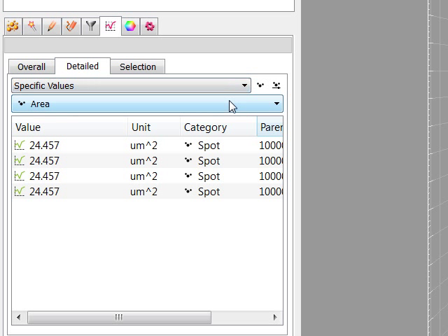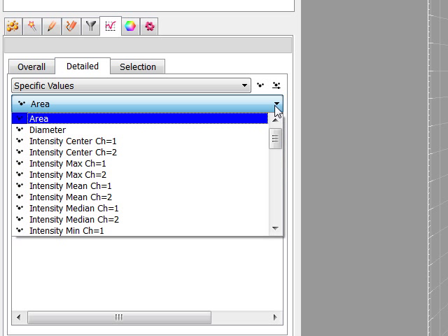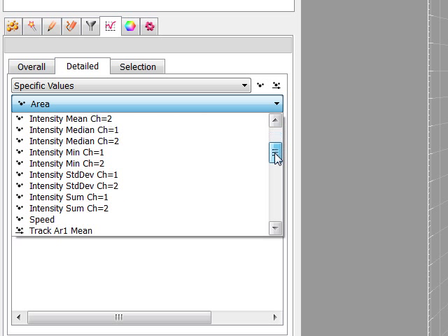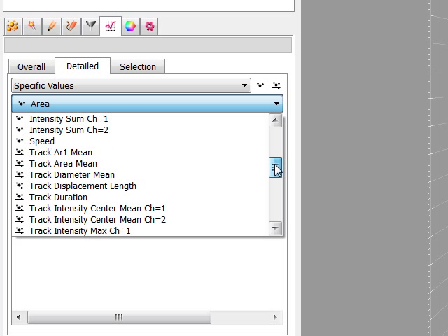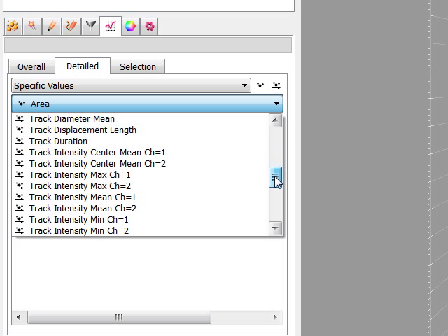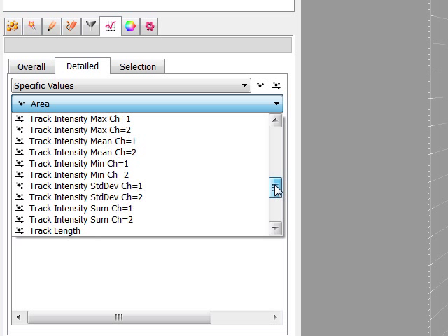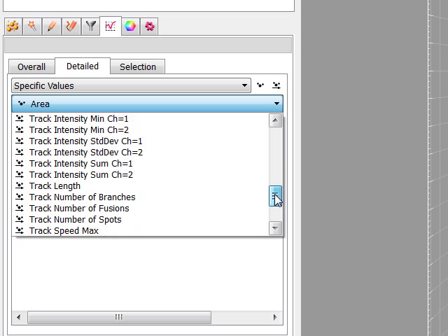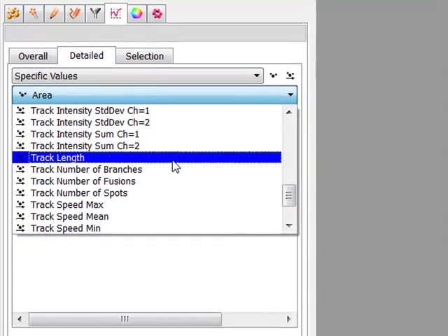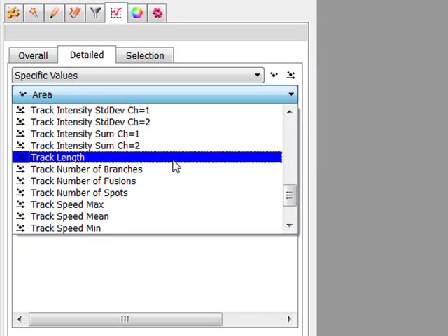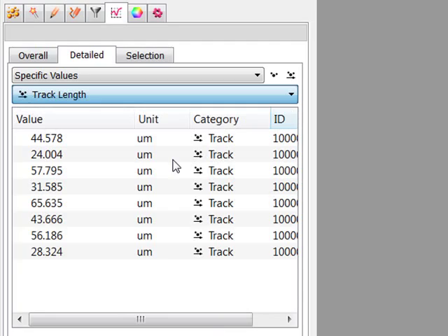In the Specific values, a second pull-down list displays the available statistical variables. Choose the variable and a value is displayed.